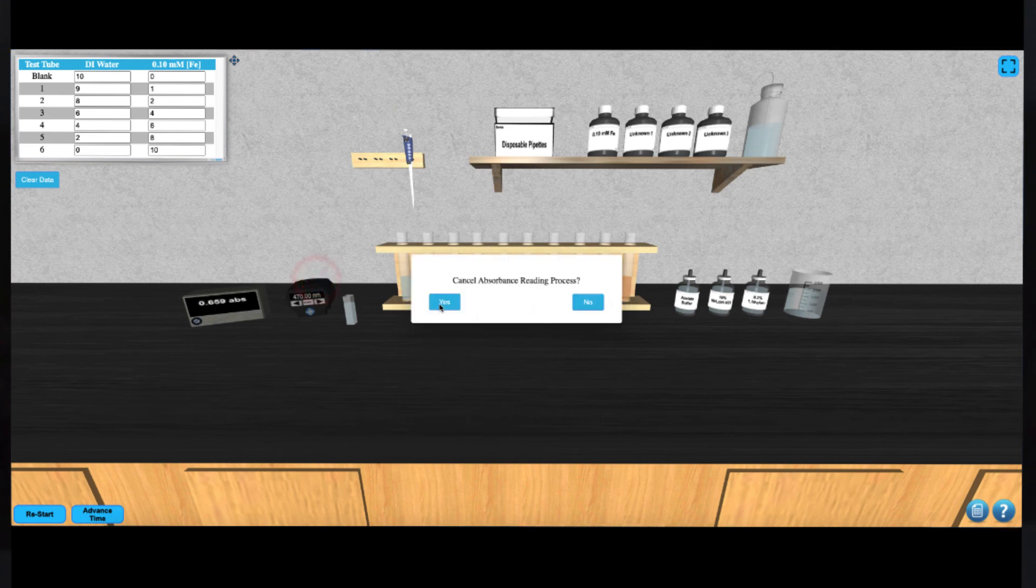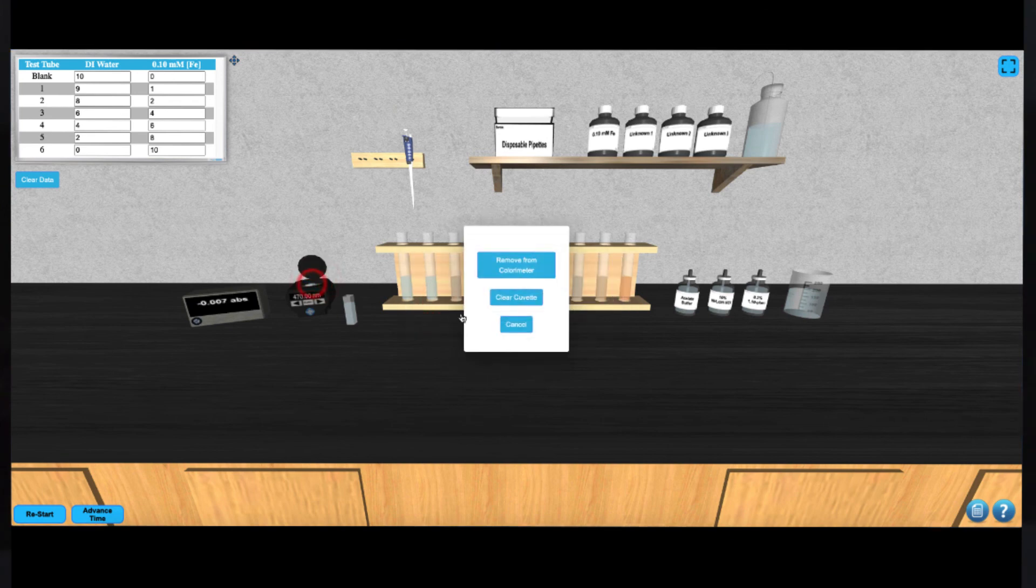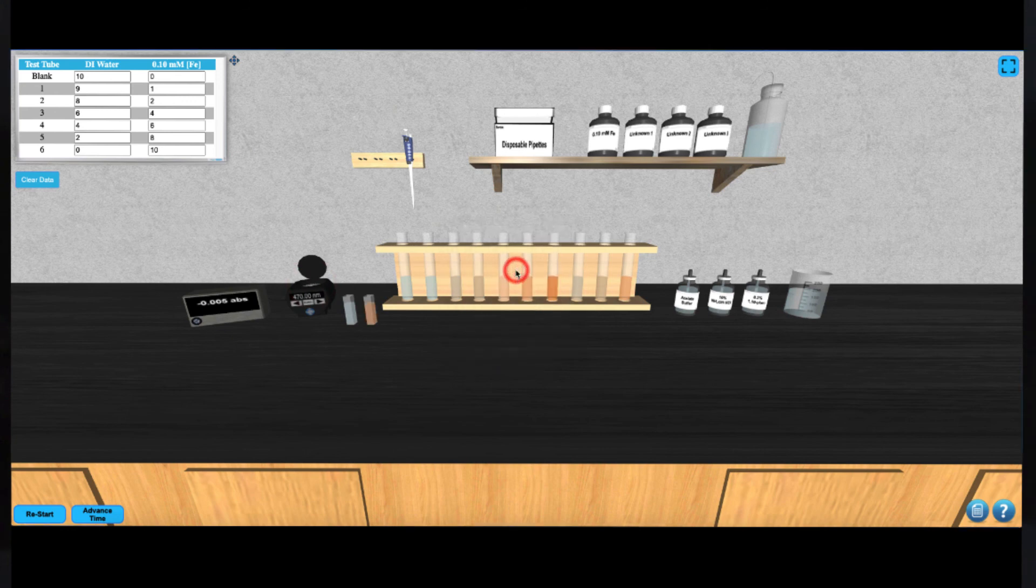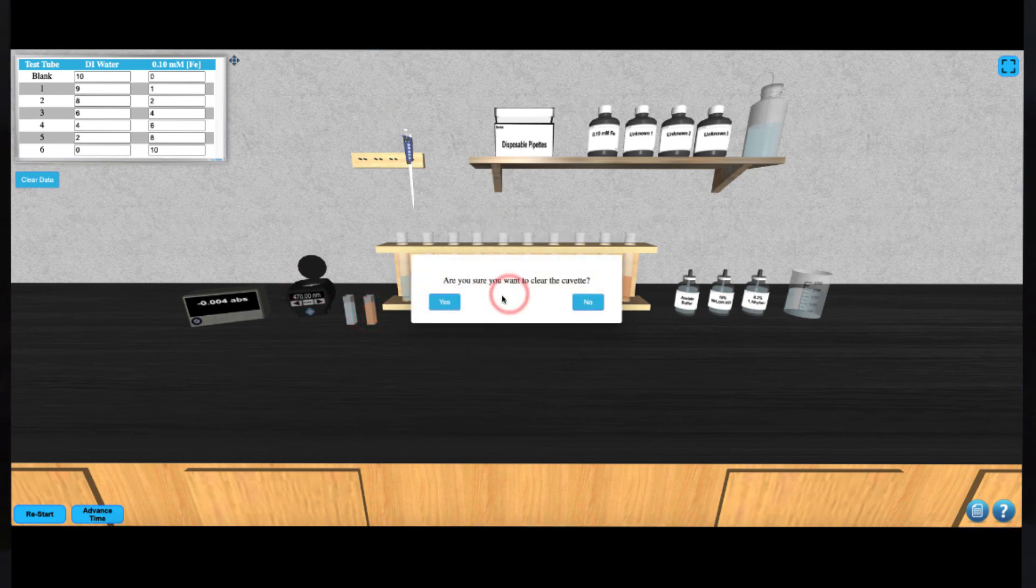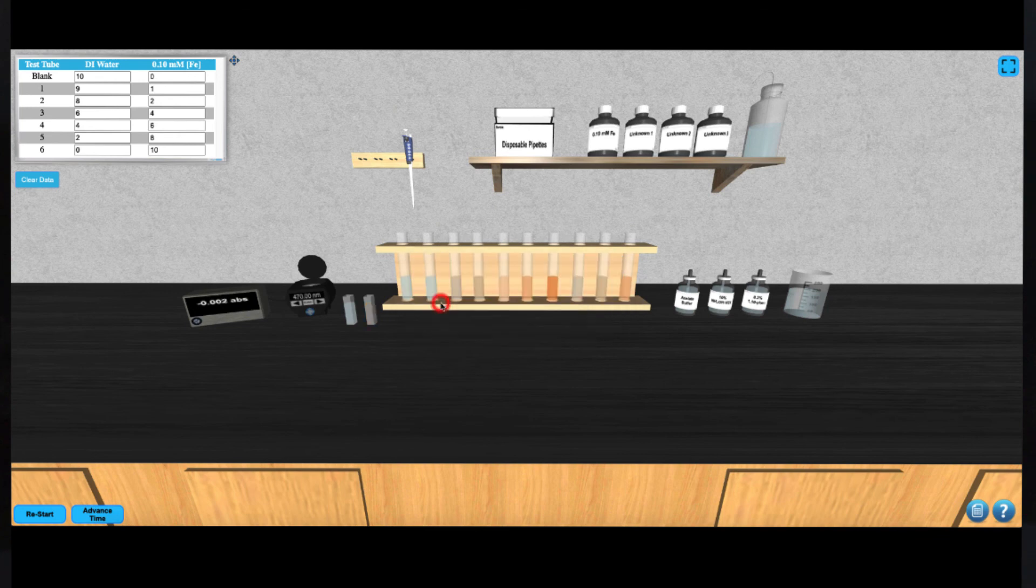Then you can remove the cuvette and empty it and get a new disposable pipette to draw up the next solution until you've completed measuring the absorbance for all of your standard solutions.